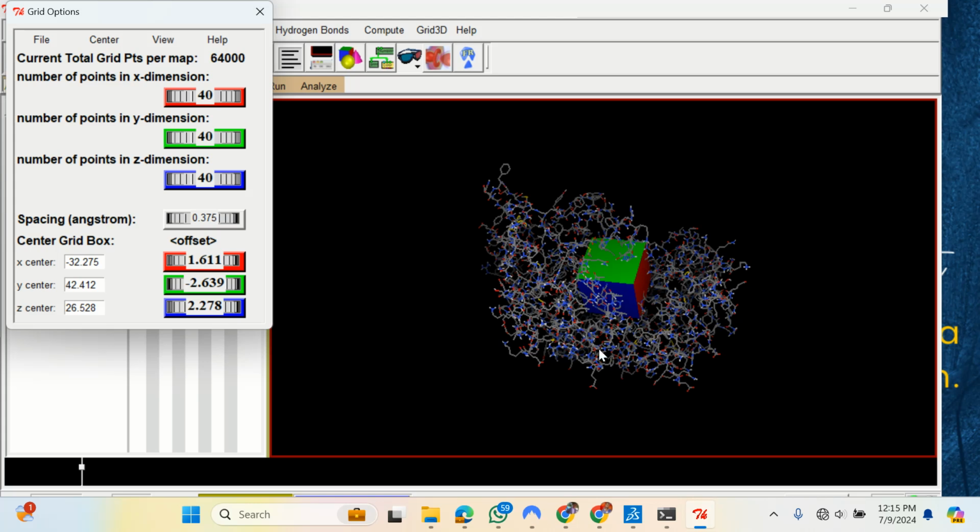That is where the knowledge of that arginine 120 in the membrane binding domain of this particular COX-2 comes into play. So we'll go to our Discovery Studio and locate arginine 120. That's not just the arginine 120, but that functional group we want to target in arginine 120. We're going to locate it and find its coordinates and come and replace it here. That's all. Immediately you replace it here, you find out that this box will go to that pocket. And then when you now target this, it's going to that.